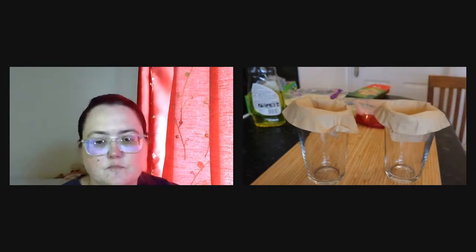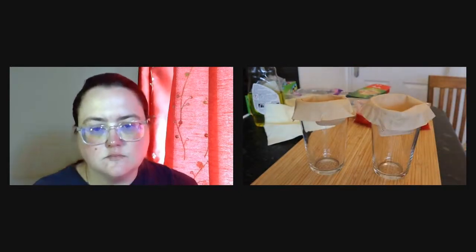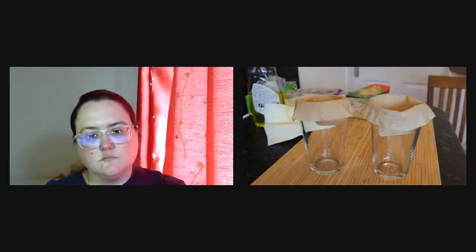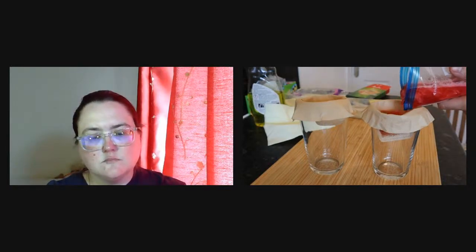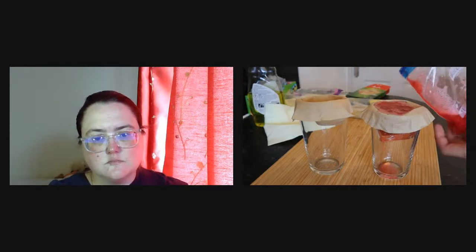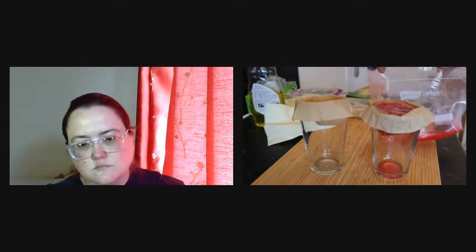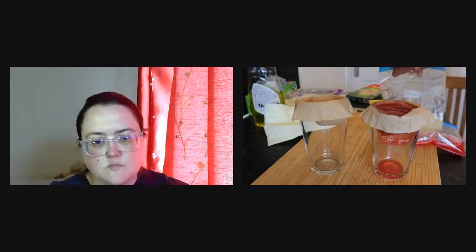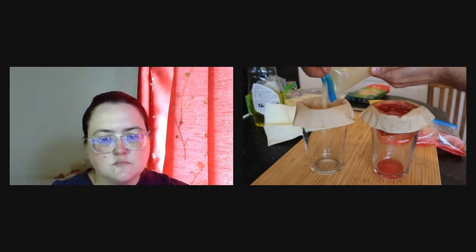Okay, so we need to filter our preparation, one for the strawberries and one for the banana. So I'm going to slowly pour that in. And hopefully we will see at the bottom of the glass a filtrate where all those big debris will not be there anymore. Okay, cool. Doing the same with the banana.